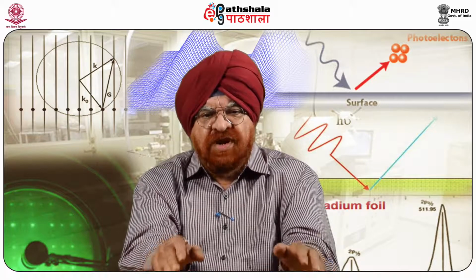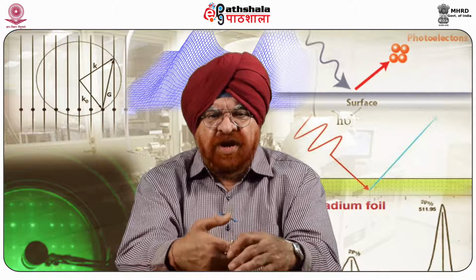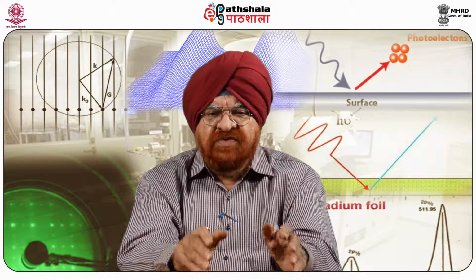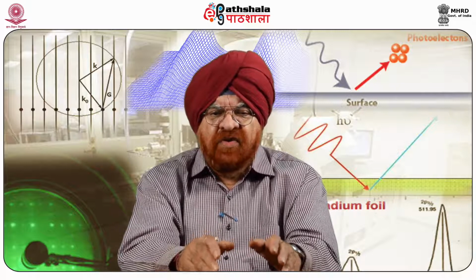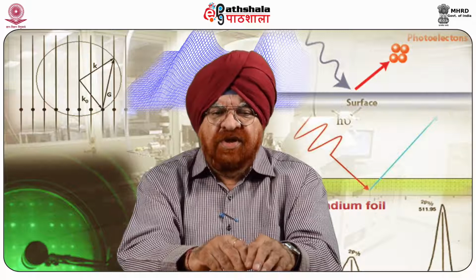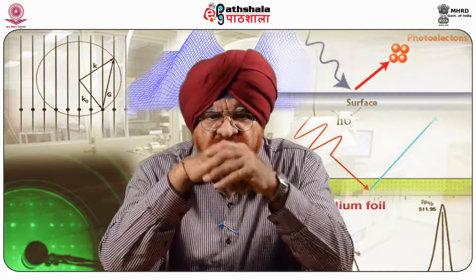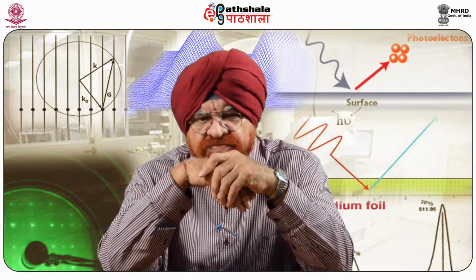Compared with transmission electron microscope, three-dimensional AFM images are obtained without expensive sample preparation and yield far more complete information than the two-dimensional profiles available with cross-sectional samples.